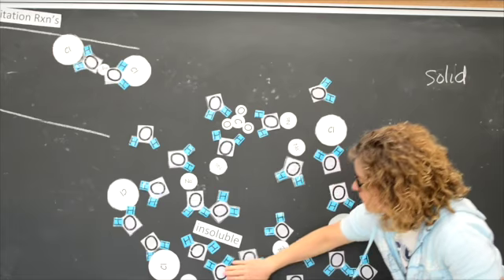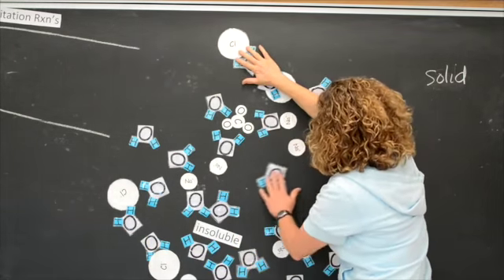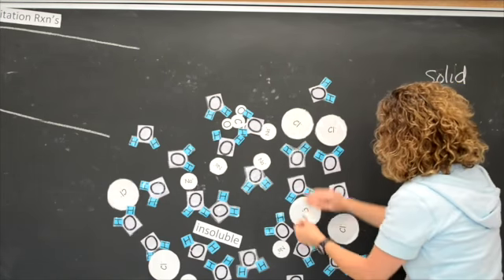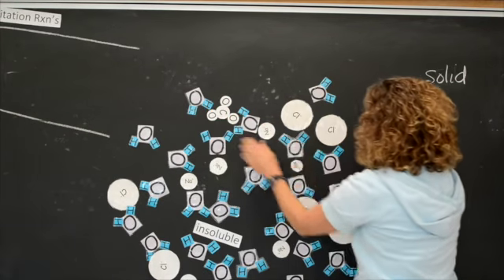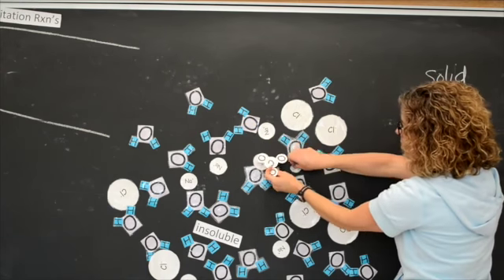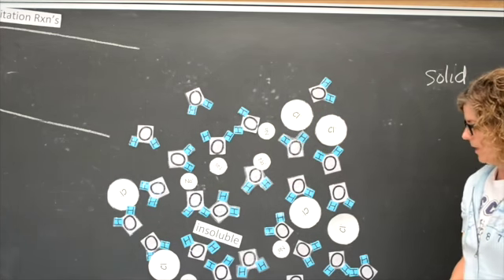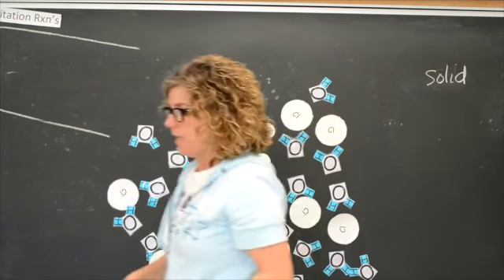Okay, and let's just do one more. I'll bring this guy in, orient my solution, bring it down into here. Okay. So this magnesium and this carbonate, strongly attracted to one another. This becomes insoluble, settles to the ground. You can have a solid white substance the next day. So it all depends. Sometimes you'll get it right away, depending on the solubility.